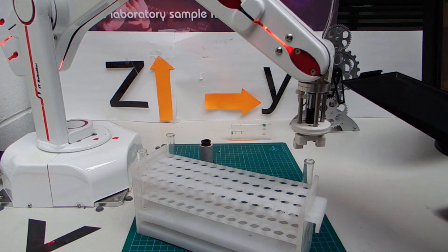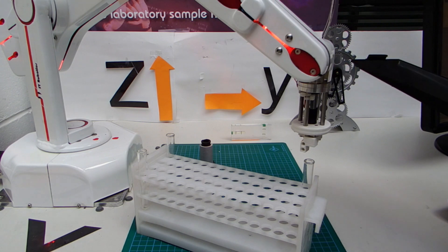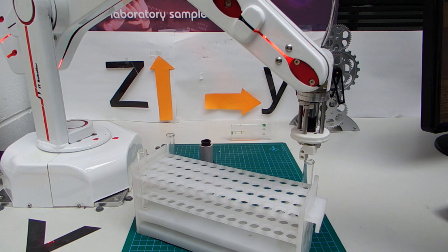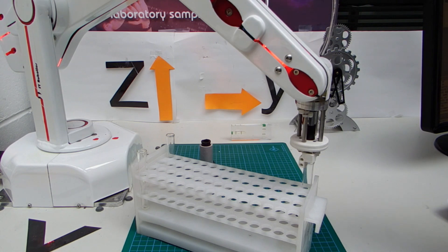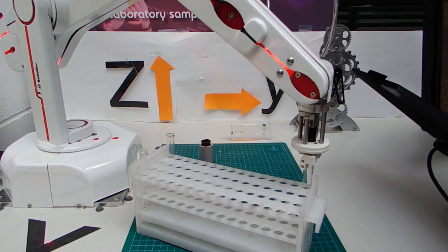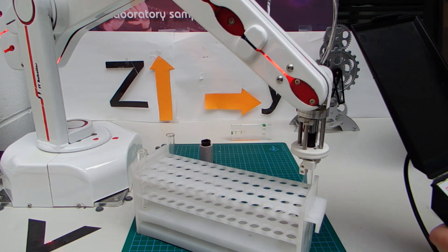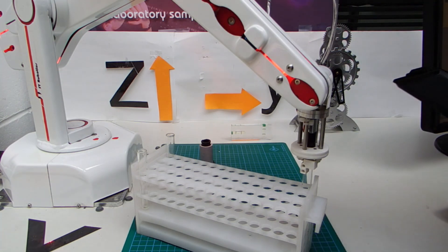That's J5. That should be enough. Switching to smaller increments — further down in 1mm increments. And then do a trial grip. That looks alright. So we learn that into position 1 by pressing set to here on position 1.